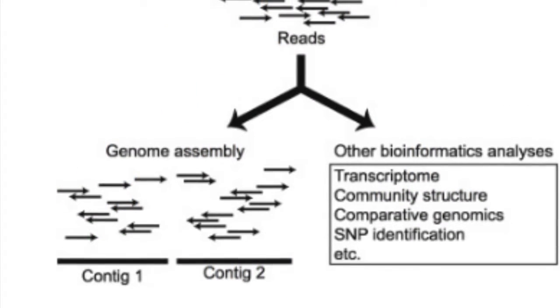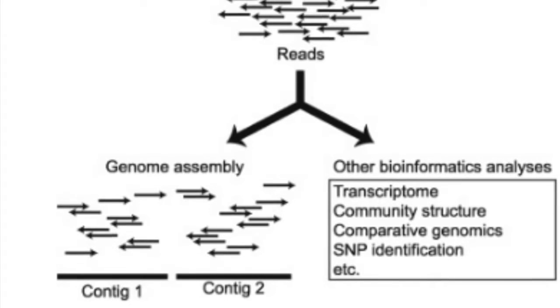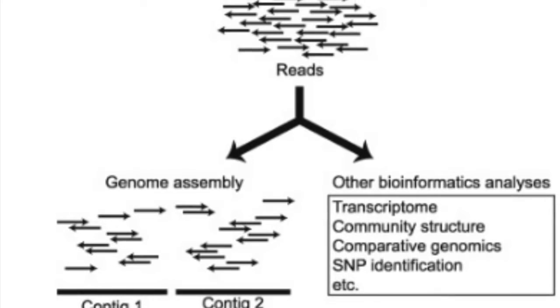The main applications of the Sanger enzymatic method actually are Thermo Fisher and Illumina. The two dominant technologies are currently available.